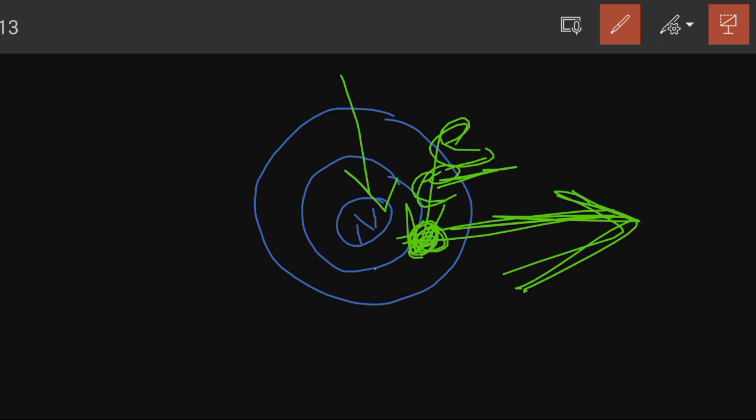The inner shell electron ejects from the shell, creating an electron hole where the electron was originally present. After the electron moves out, an electron from the outer, higher energy shell fills the hole, and the difference in energy between the higher energy shell and the lower energy shell may be released in the form of an X-ray. The number and energy of the X-rays emitted from the specimen can be measured by an energy dispersion spectrometer. So this is the whole phenomenon.